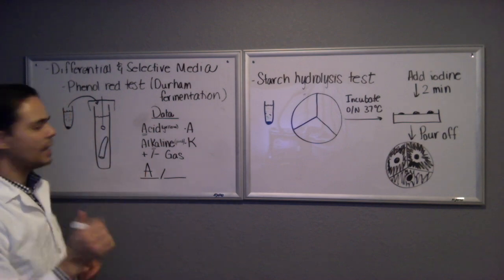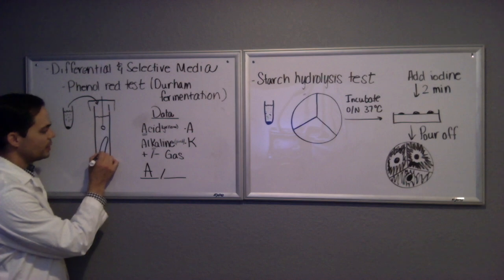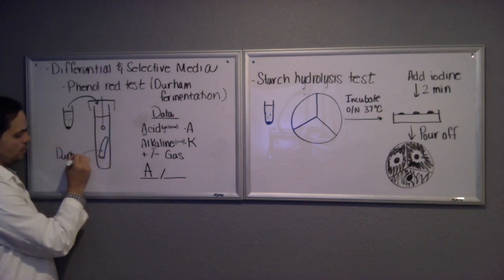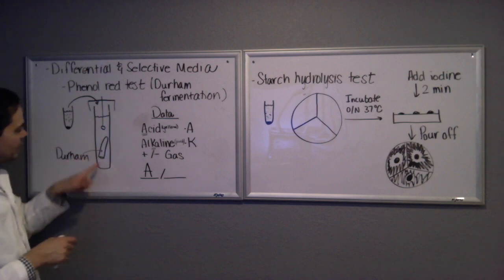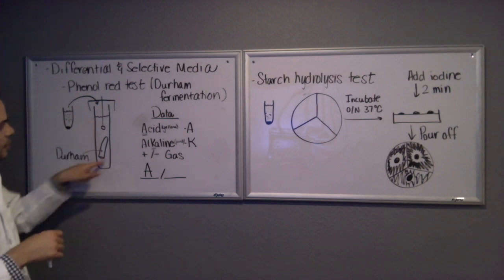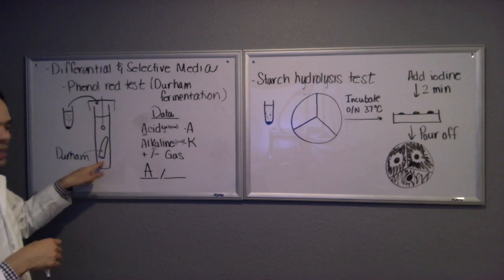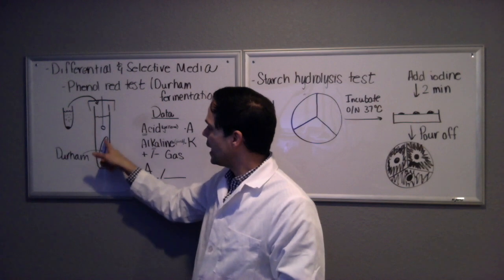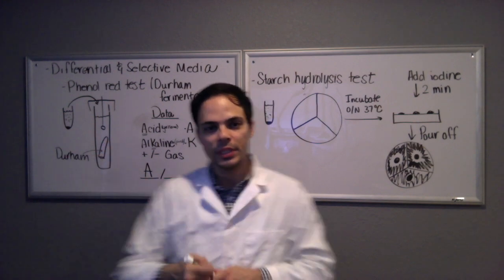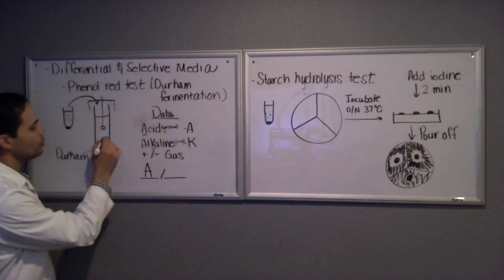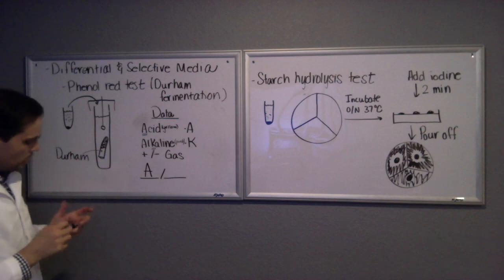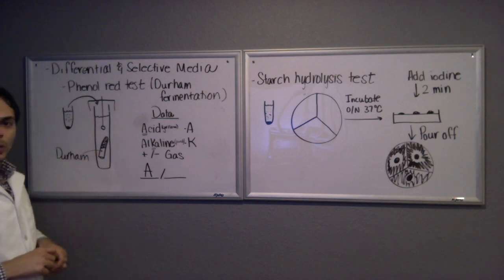The second thing you want to look at is this little tube in here. This little tube here is called a Durham tube, and it's upside down inside of this bigger tube. What it does is that it'll catch any gases that are made during the fermentation process and it will actually fill with bubbles in there.